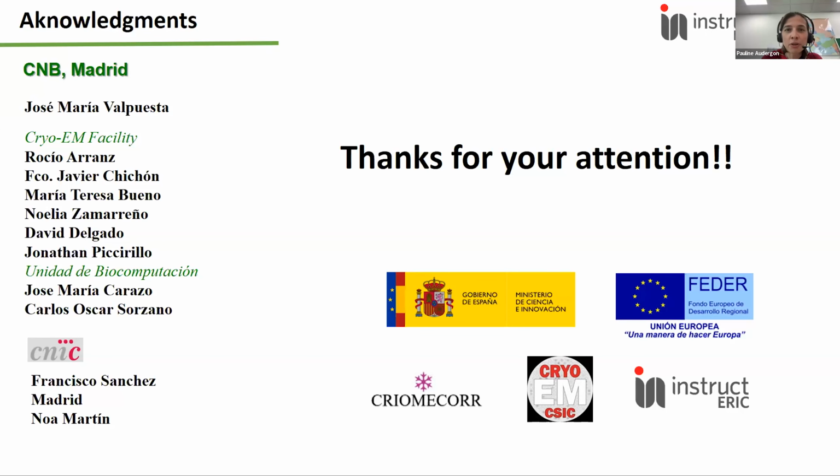And we have a question from Durand. So do you screen multiple lamella before choosing the one to study in detail? Darren, I didn't get the last part of the question. Yeah, so Thermo Fisher are promoting a new machine called Arctis that promotes this approach. So are you following such an approach of screening multiple lamella before choosing the one that you are studying?